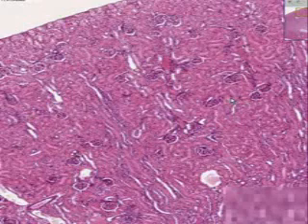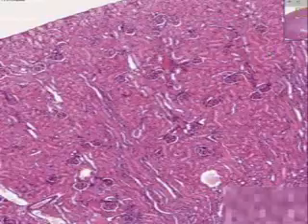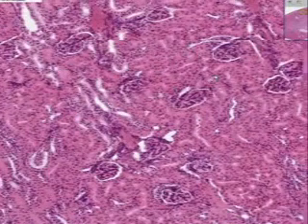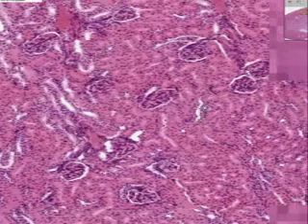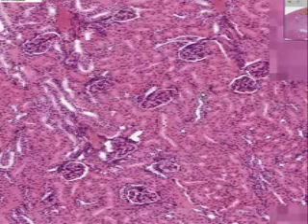The glomeruli are surrounded by tubular structures. 90% of these tubules have lumens which are so filled with cytoplasm. They are called proximal convoluted tubules. These are all proximal convoluted tubules here and here and here. If the tubules in the cortex have enough guts to form an actual lumen, then this is a distal convoluted tubule. Here's a distal convoluted tubule here. The rest of these are proximal, and here we have the glomeruli.